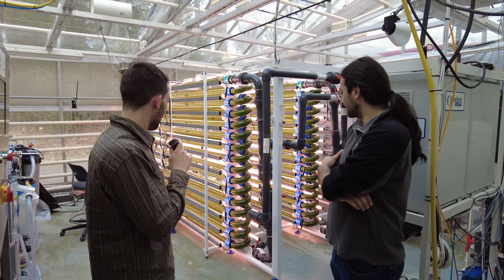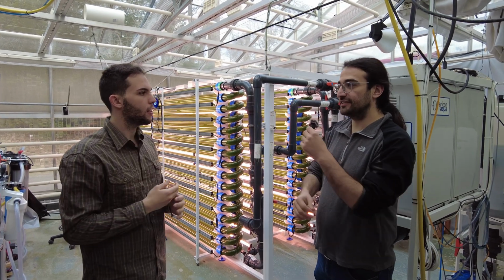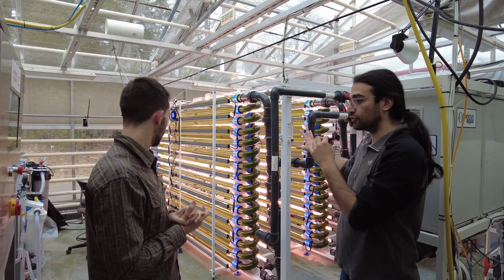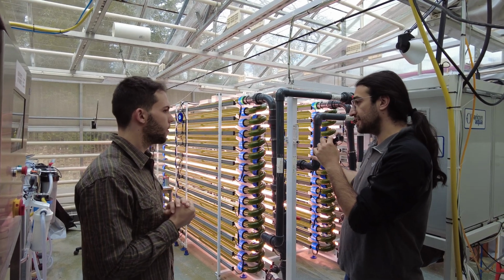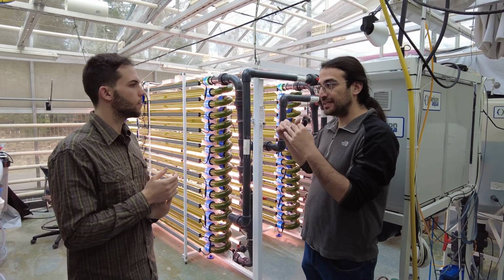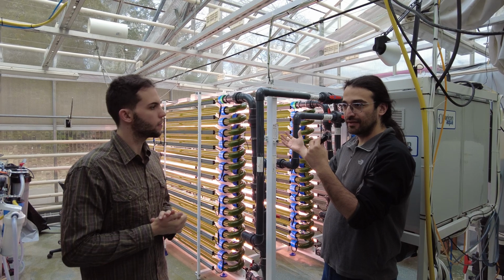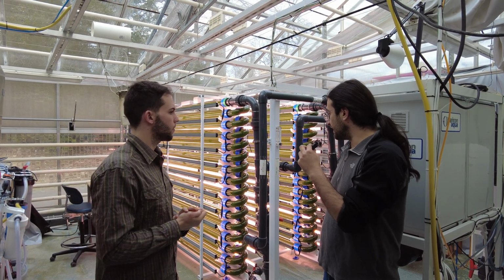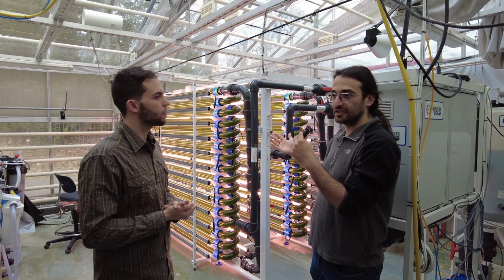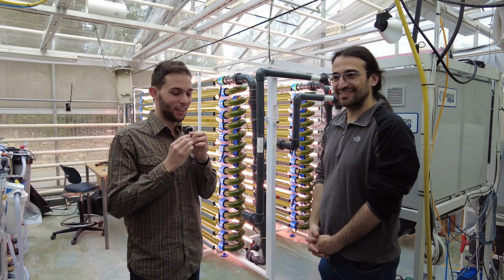So you turned off the compressor now, but we can still see bubbles around. These bubbles are actually injection of CO2 into the system, right? For algae production, we need two main gases, which are pure carbon dioxide and air itself. That means in this photobioreactor we have infrastructure to inject air and carbon dioxide whenever it's needed. Carbon dioxide we use for two reasons. One is to regulate the pH. The other is that since our algae is photosynthesizing, they need carbon, and the carbon comes only from the carbon dioxide. But air is important to make sure that the system is mixed very well, and there are more technical details, like the dissolved oxygen percentage that we need to regulate, and air helps us do that. Wow, very interesting, and so many parameters to take into account.